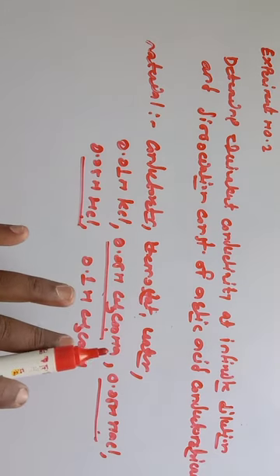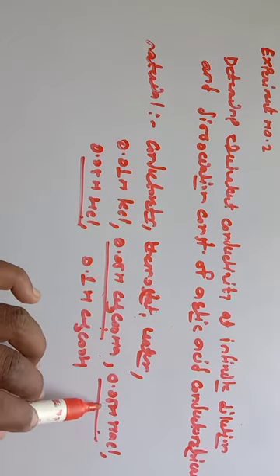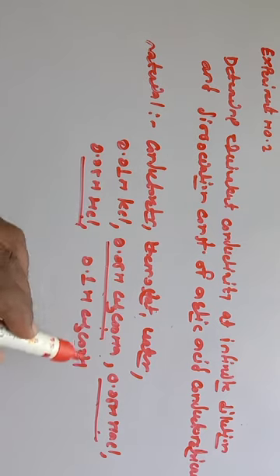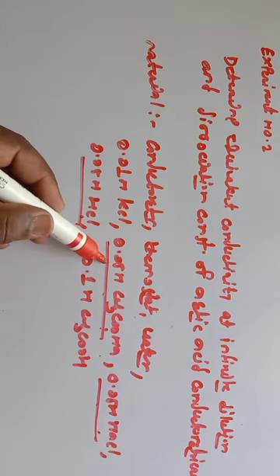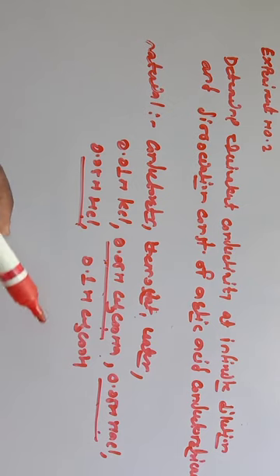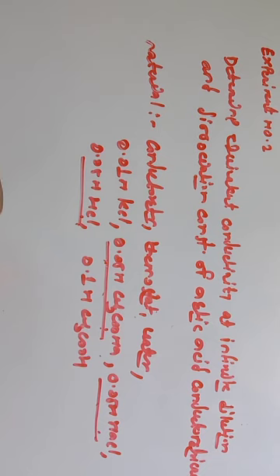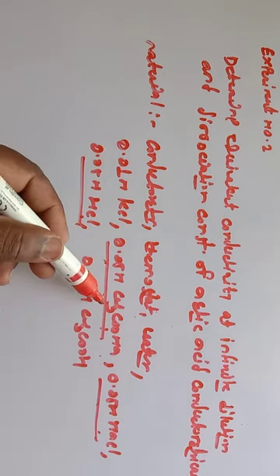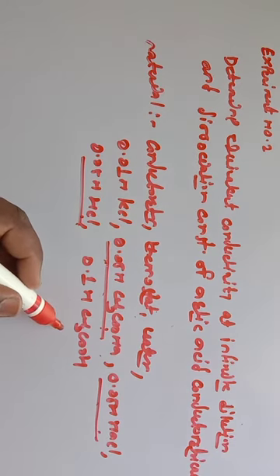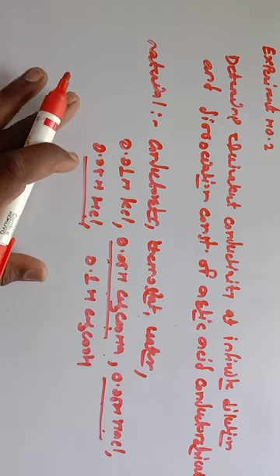Therefore, in this process, they have used different concentrations, that is 0.05 normal sodium acetate, 0.05 normal NaCl, and 0.05 normal HCl. Then you have to prepare different concentrations from this 0.05 normal stock solution, find out the equivalent conductivity at the given dilution, plot the graph and easily find out the equivalent conductivity at infinite dilution. With the help of this, we can find out the equivalent conductivity for acetic acid, because the equivalent conductivity is an additive property, and therefore in the material we require this.